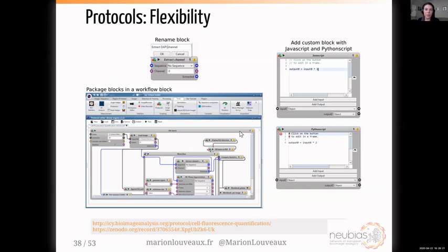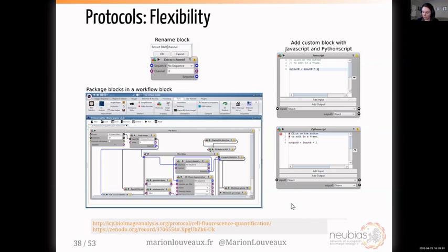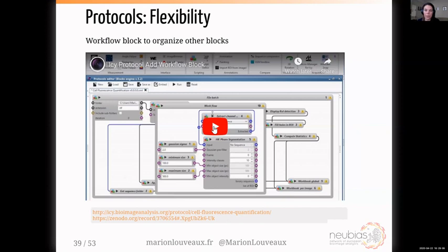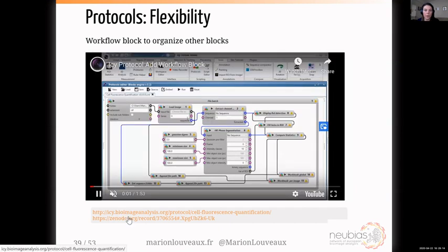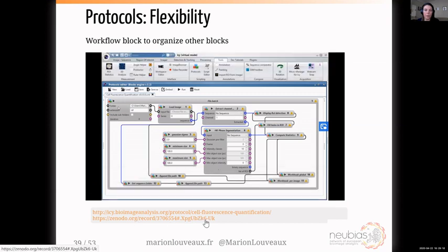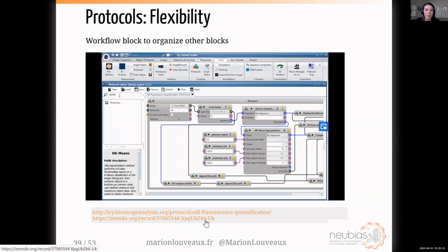A few more general options: you can rename blocks, package blocks into a workflow block — I'll explain with a video what this means — and add custom blocks with JavaScript or Python scripts if you're still missing some important components. This provides the whole flexibility you need for designing protocols. I encourage you to use workflow blocks even if you're just starting, because it helps a lot to tidy your workflow. This series of blocks corresponding to the segmentation component will be packaged into a workflow block.